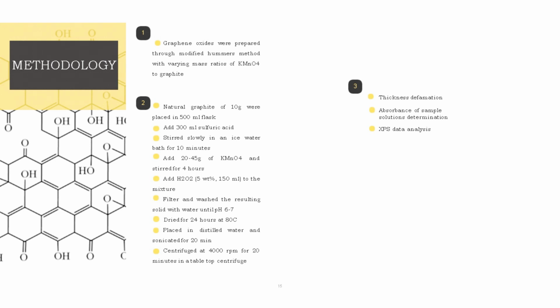Third is the determination of the sample, where the thickness of the samples was measured, absorbance of sample solutions was determined, and the XPS data was analyzed. In the XPS data analysis, peak deconvolution was performed using Gaussian components after subtraction of a Shirley background.